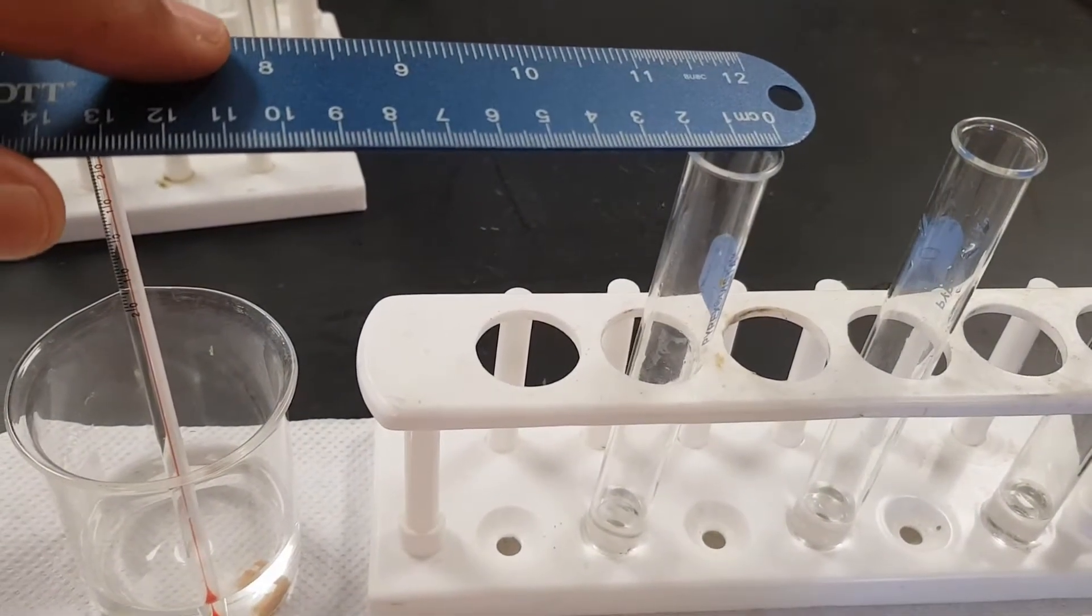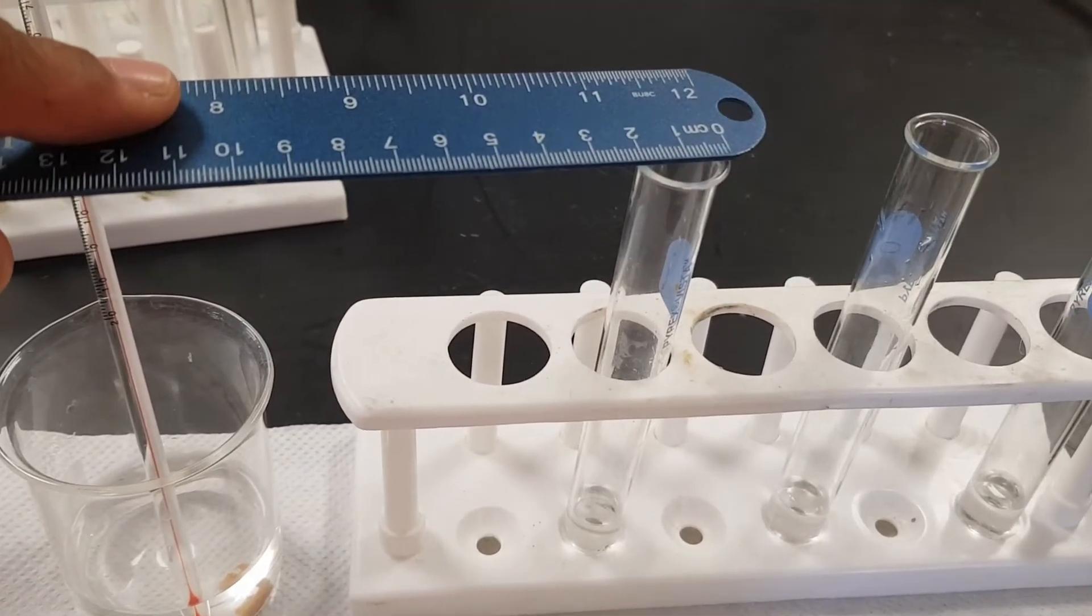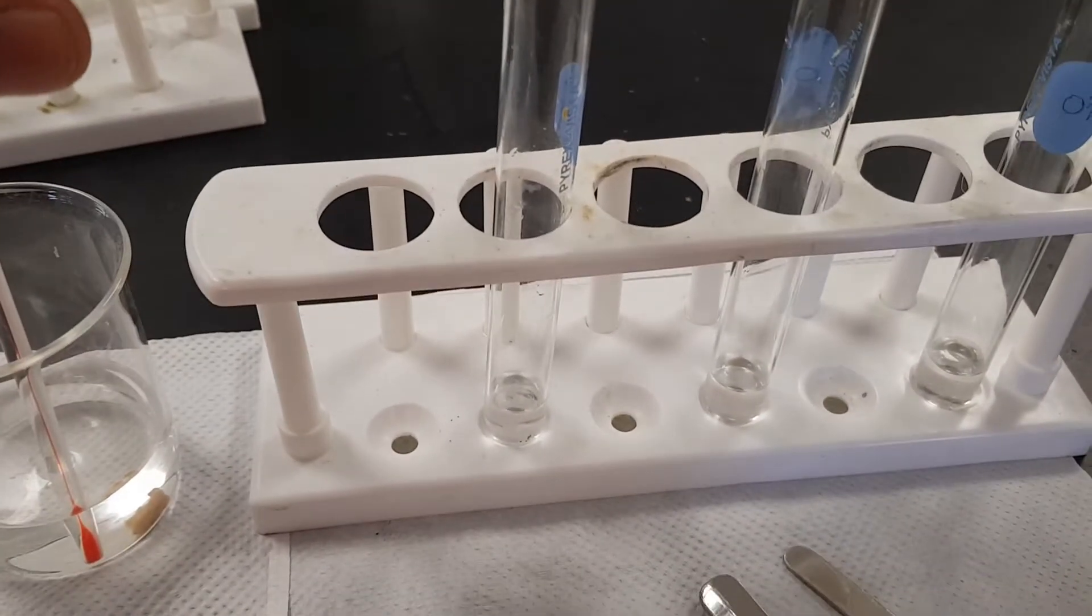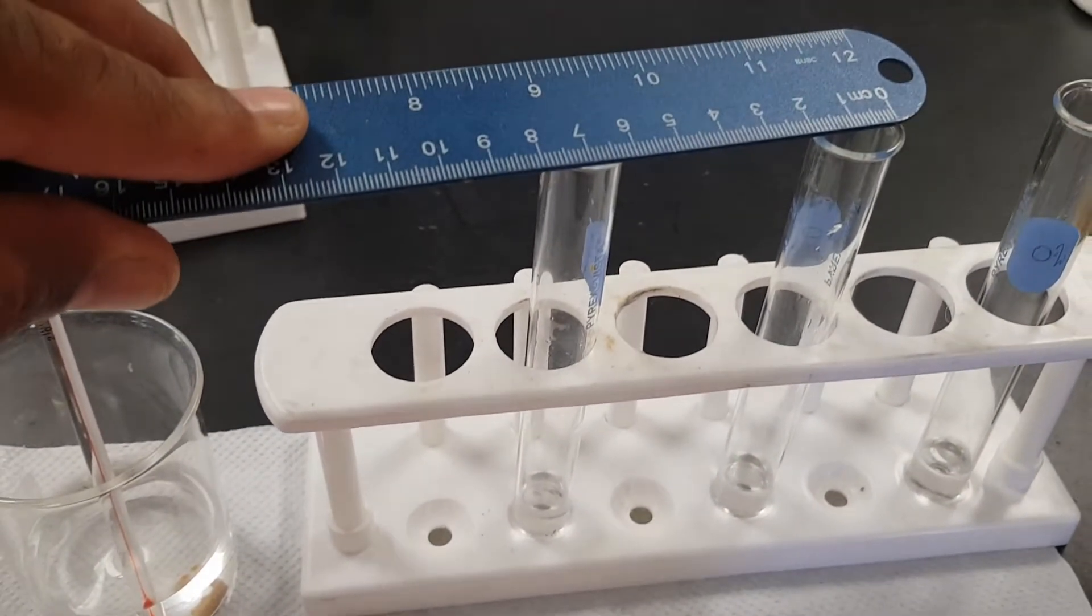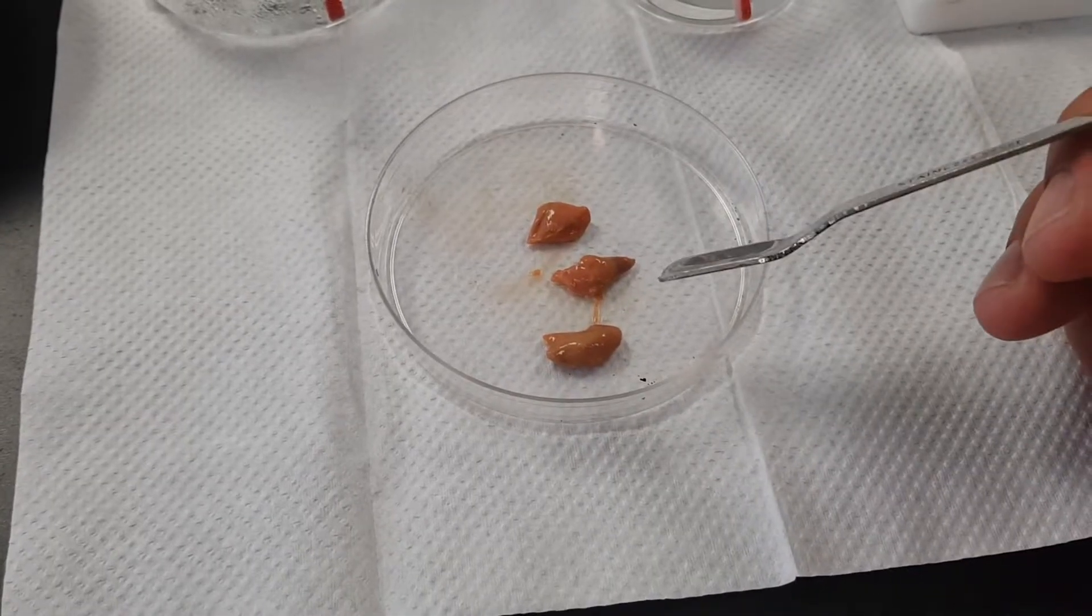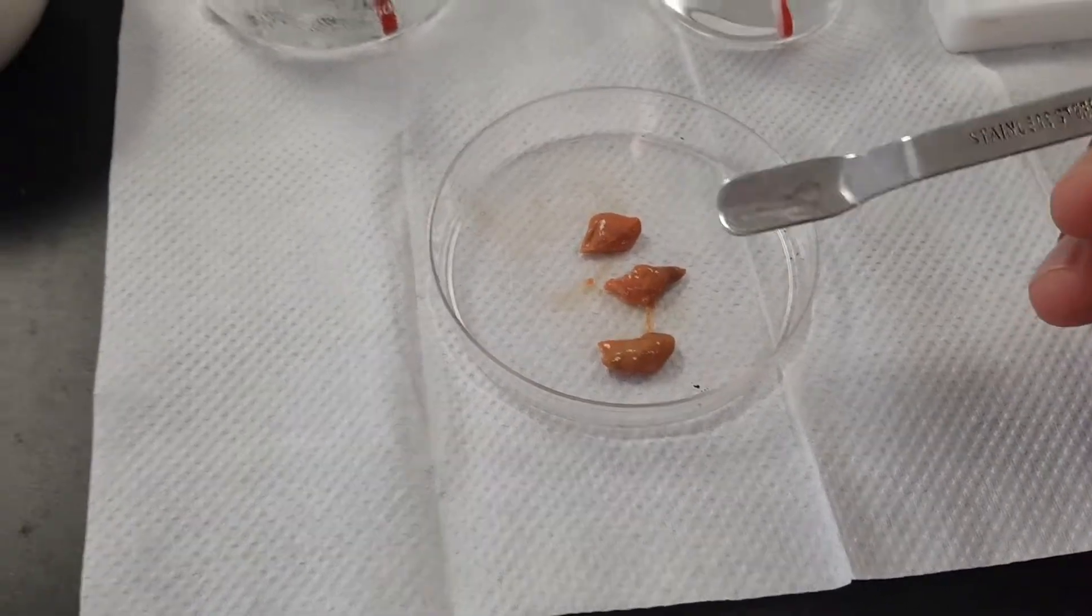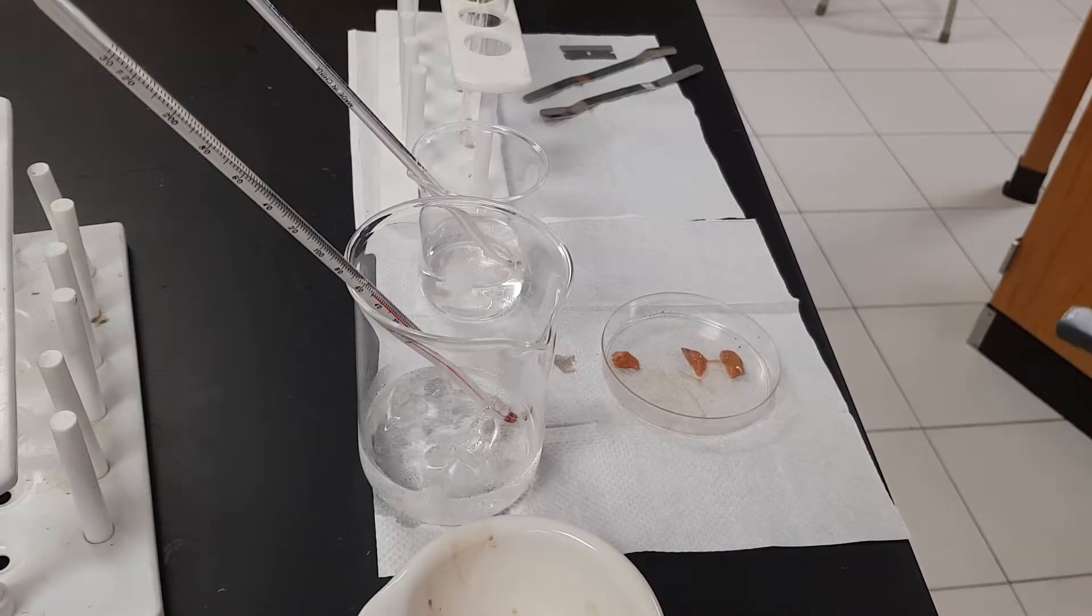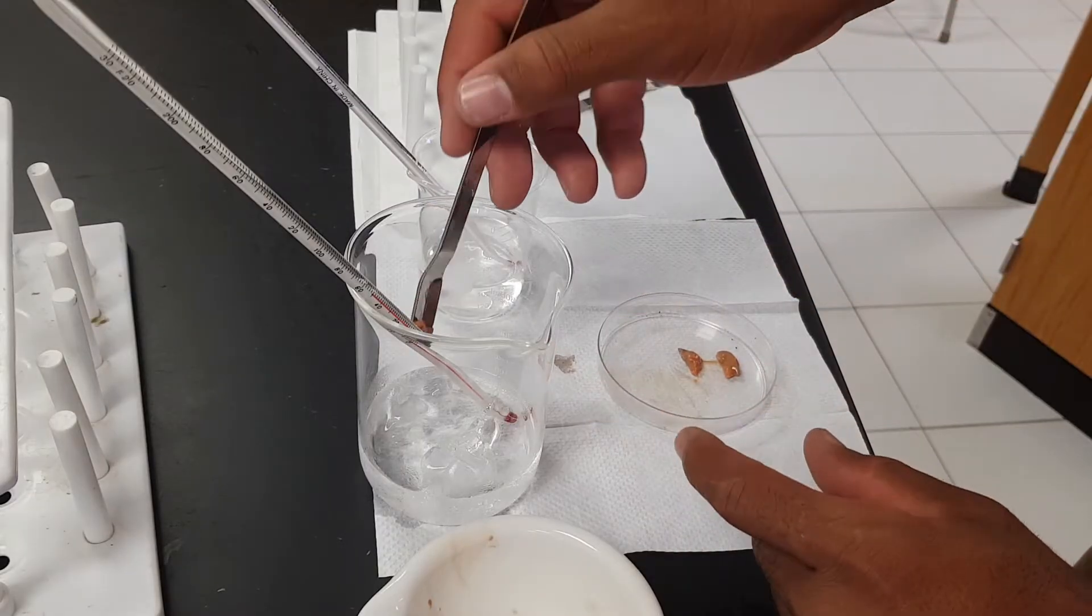Next thing you want to do is to measure the diameter of your test tube. Once you measure the diameter you can find the radius because you will need the radius to do some calculations. The liver is already cut in equal portions. Each of this liver will be placed into different temperatures of water, so one will be placed into the ice water bath.